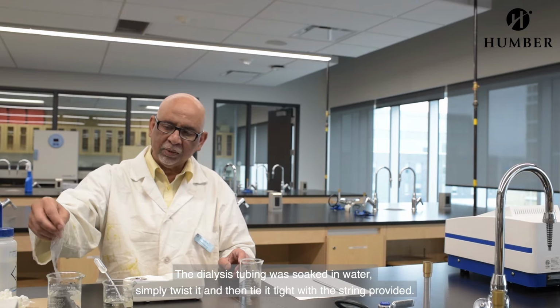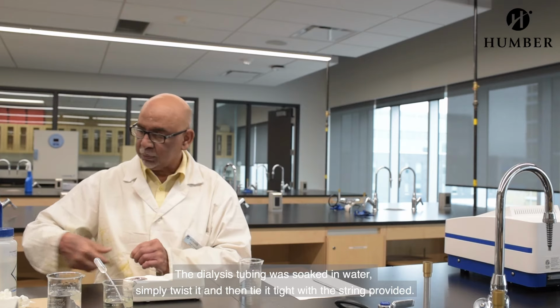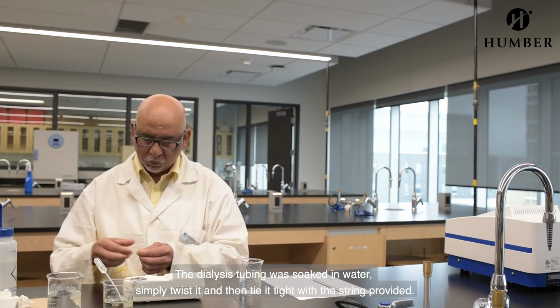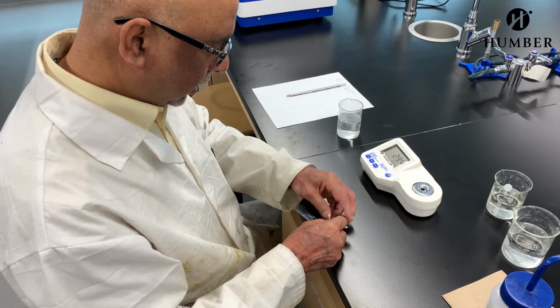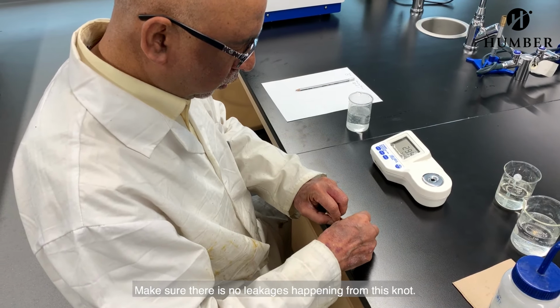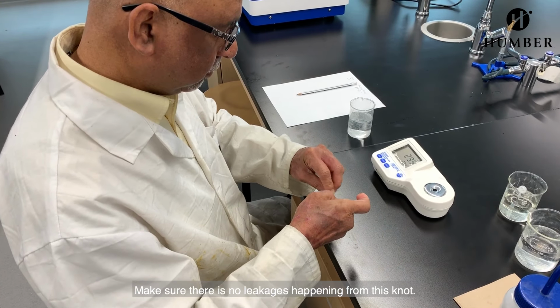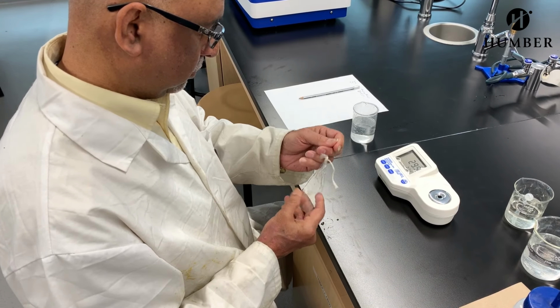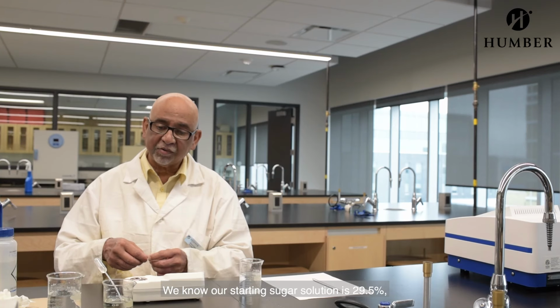Now, the dialysis tubing was soaked in water, and initially, like we said, just twist it and then tie it. These are the things which I see students really struggling with, but it's not that difficult. You just want to tie it nice and tight. You want to make sure that there is no leakage happening from this knot.